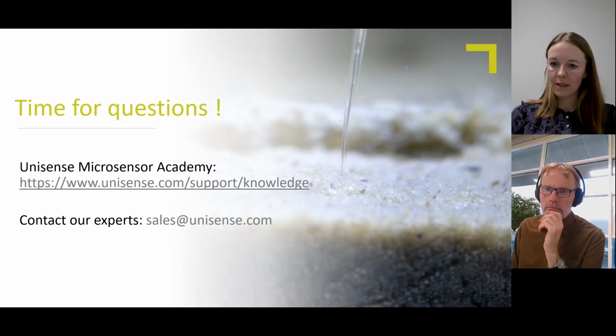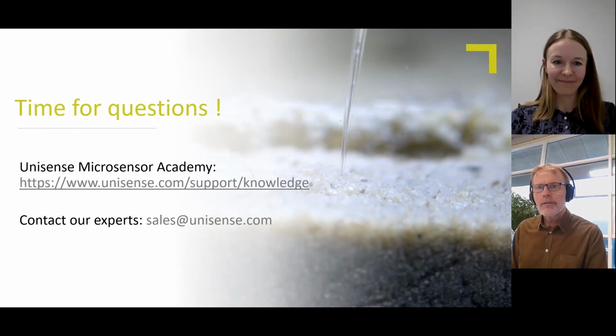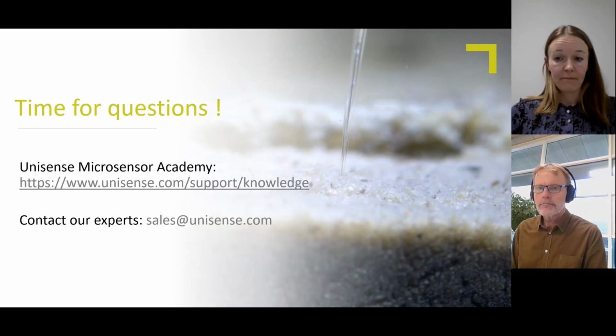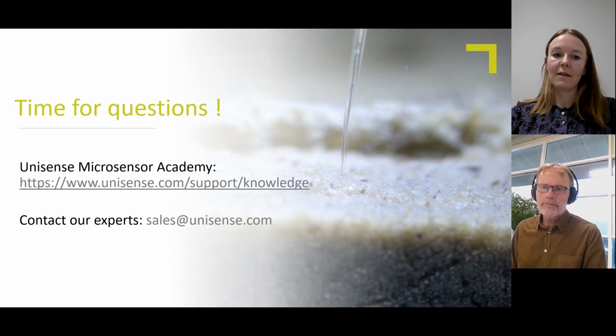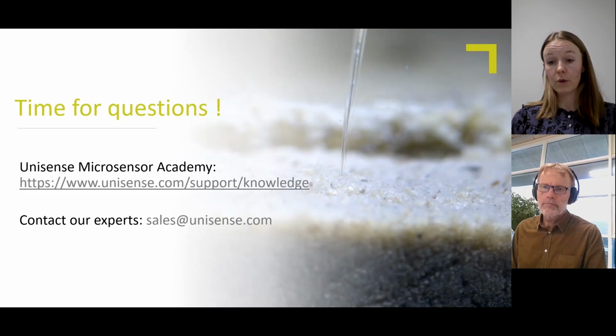The question is about the best sensor to choose for an oxygen profile in sediments. It really depends on the type of sediment. Typically people use a tip size of 50 or 100 microns in sediments, but it depends on whether you have larger particles, stones in it. It also depends on the resolution you would like to get from the profile, and how steep the gradients are in the sediment. You're welcome to send us an email with more information about the sediment you are going to measure, and then we can comment a bit more on it.